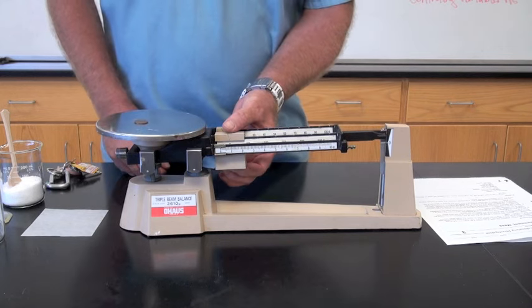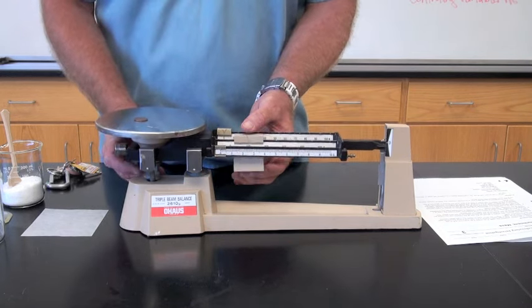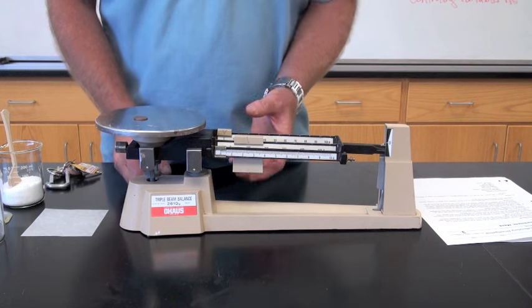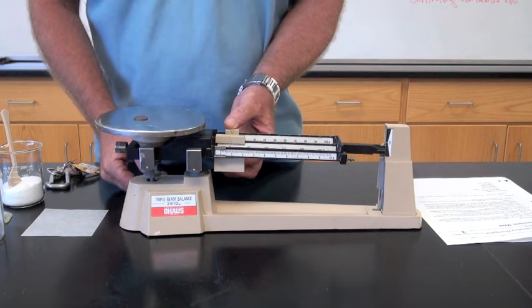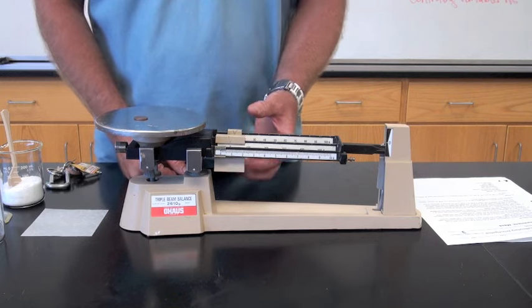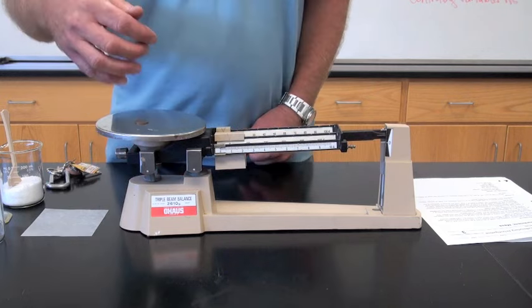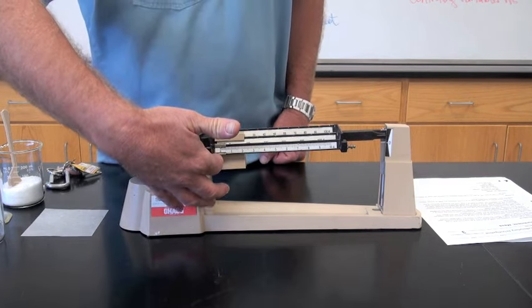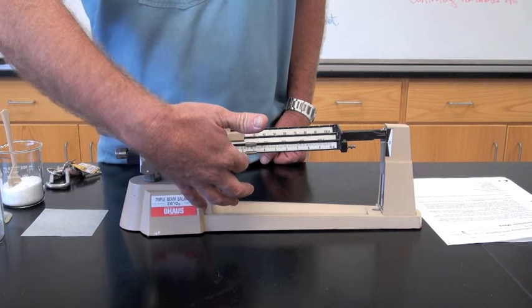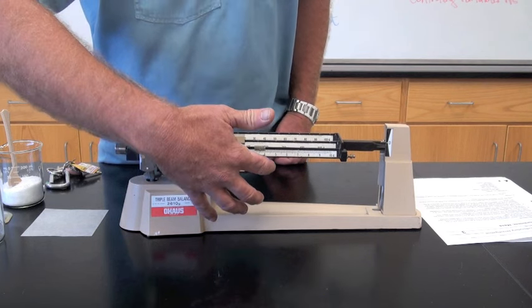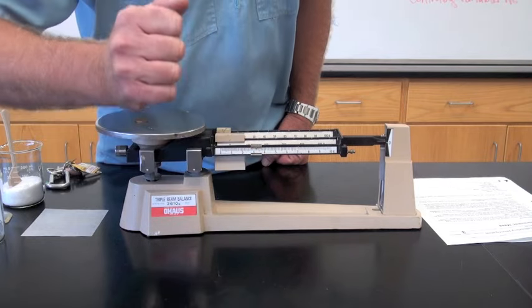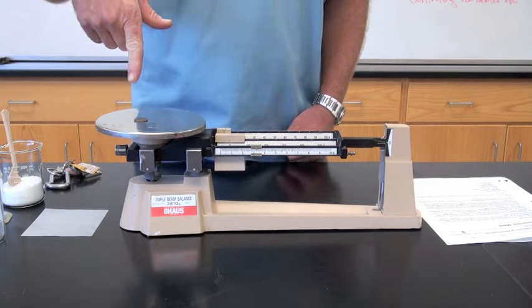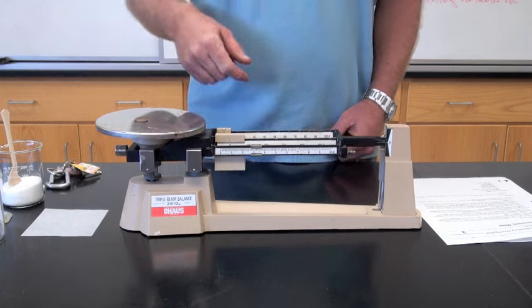We always start with the middle rider, the hundred-gram rider first, and the pointer drops below zero, we know we've gone too far. So we back up and go to the ten-gram rider in the back, also too far. Now we go to the tenth of a gram rider in the front, and carefully move it over until the pointer is at zero. And when we have a mass of our penny, up to the tenth of a gram.